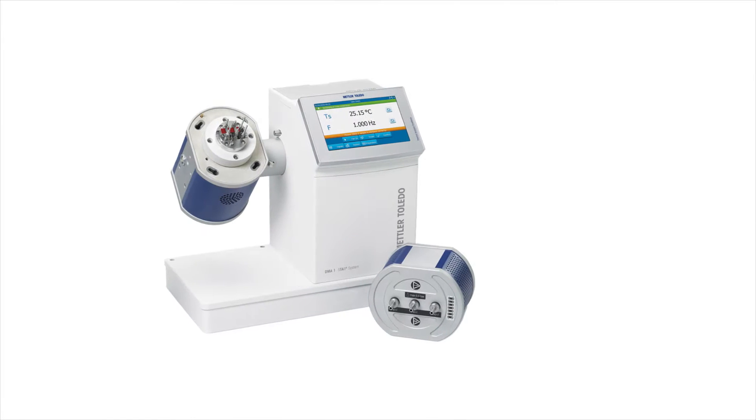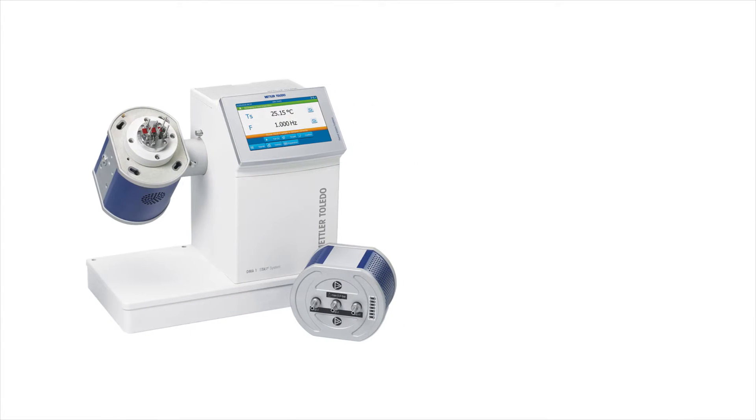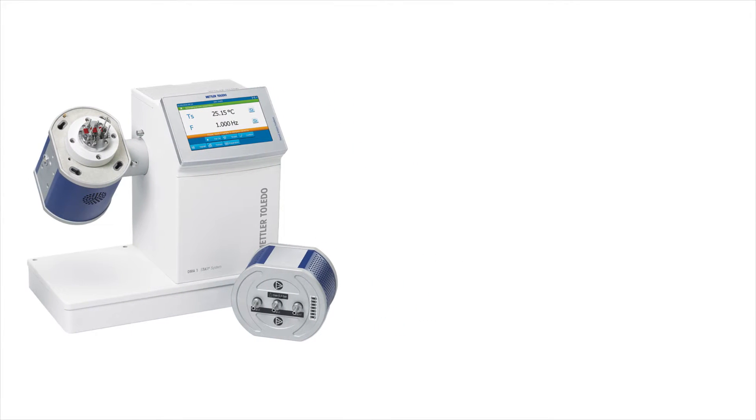The Mettler Toledo DMA is a versatile, easy-to-use DMA, allowing you to measure properties in all kinds of materials.